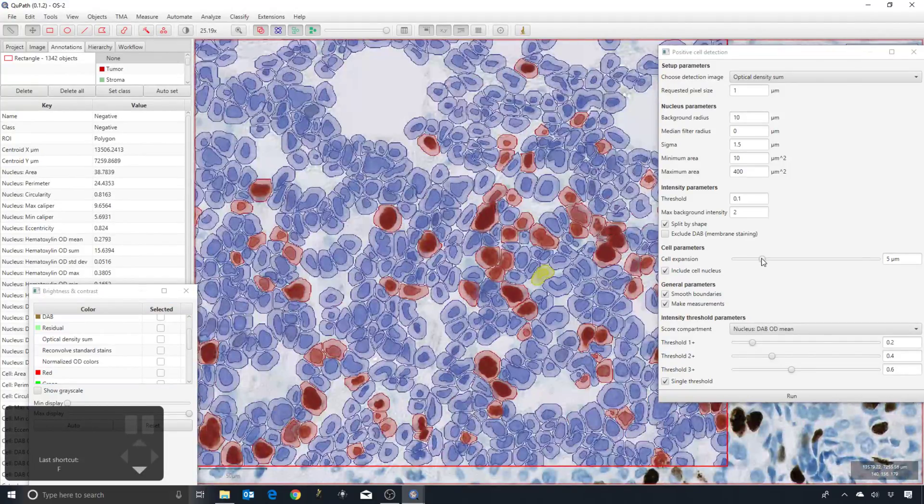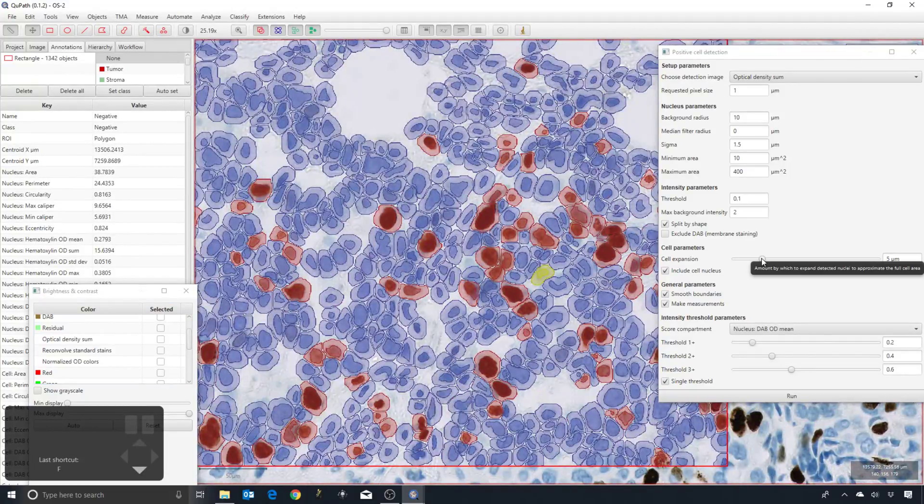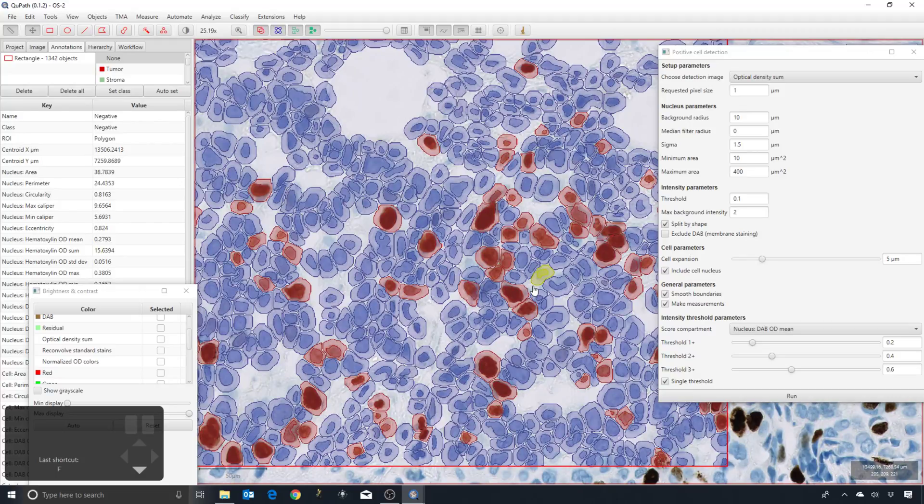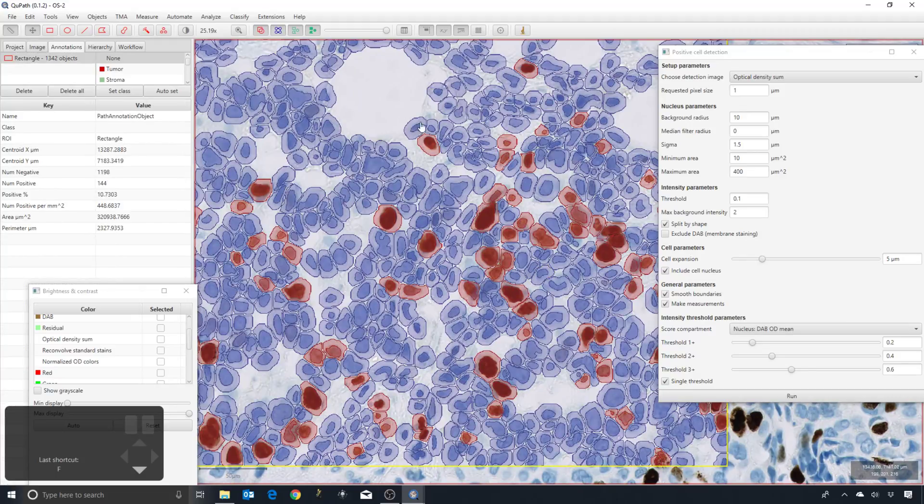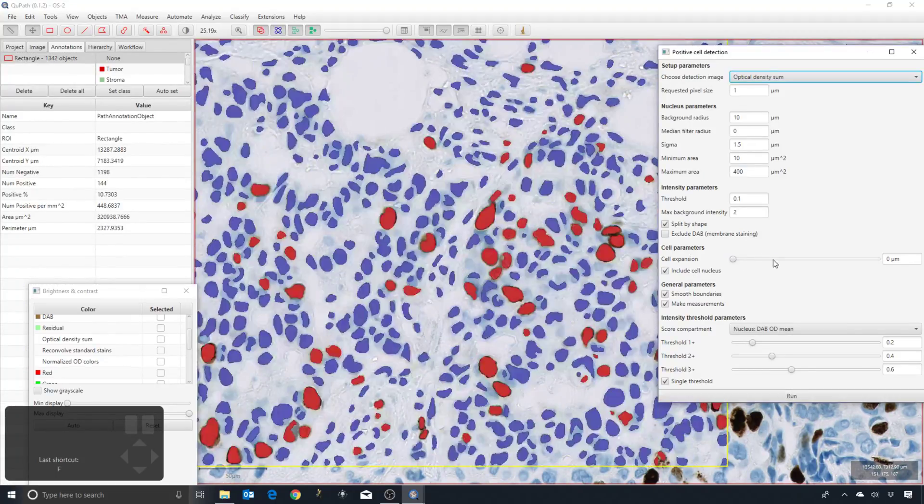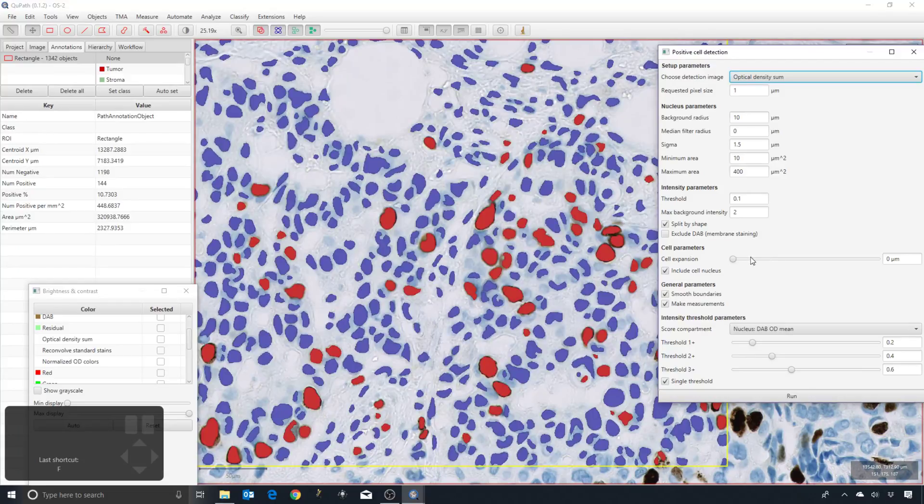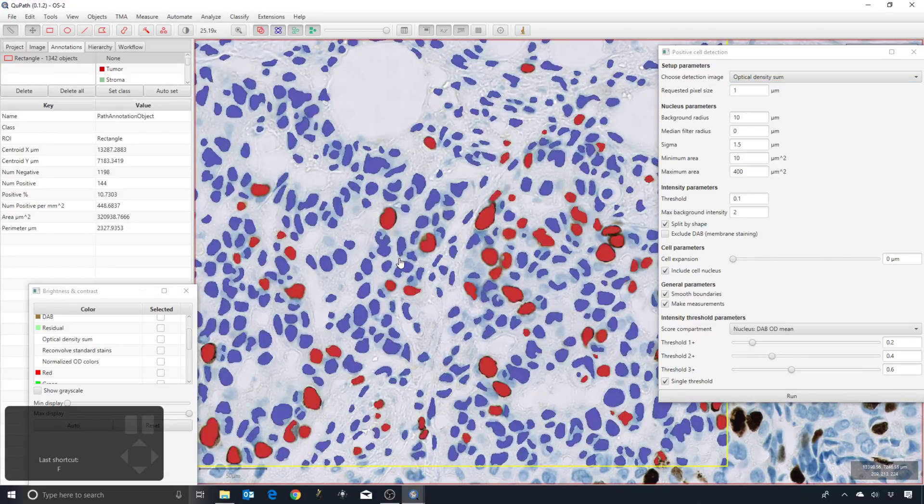This is based upon distance. QPAP will detect the nuclei and then expand. If I don't want that, I can decrease this value to zero and then we only have a nucleus detector.